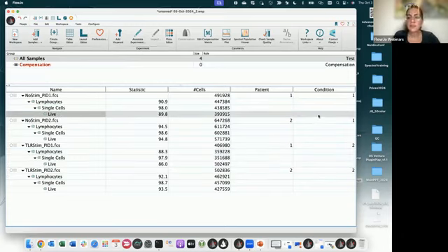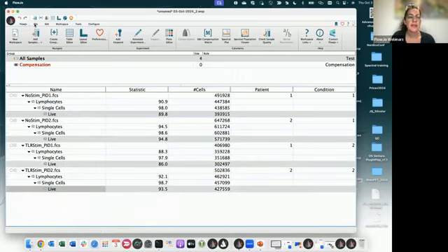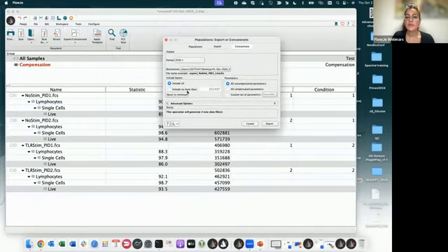Now that I have two variables here, I can select the populations that I want to concatenate, right-click on that, and choose select equivalent nodes. This is a tip that I give you to make it faster. It will select exactly the same population at the same level with the same name. Then I can go under Files, Export/Concatenate Populations. At this point, you have two options.